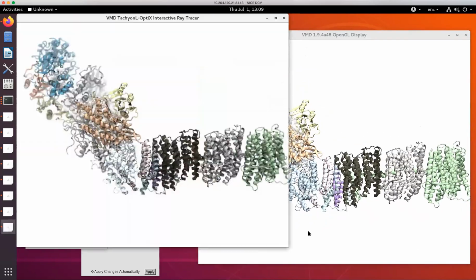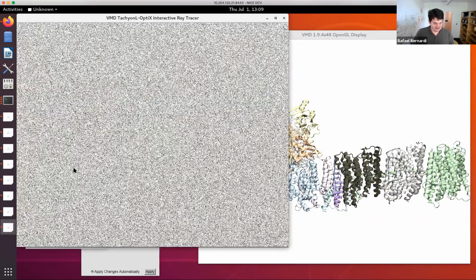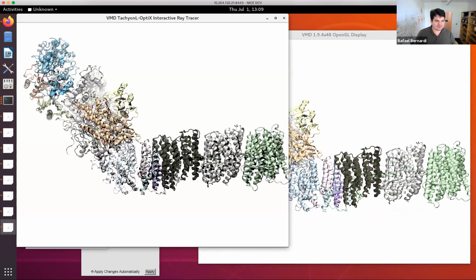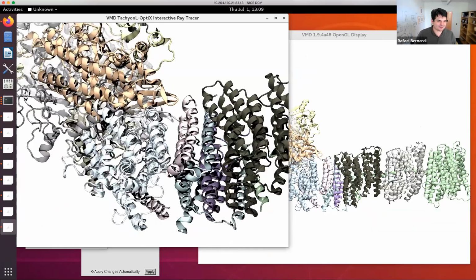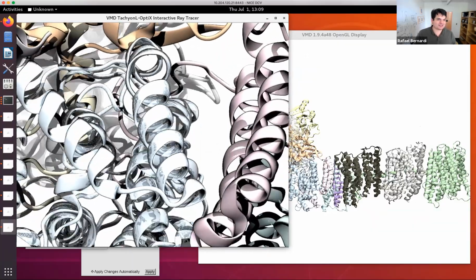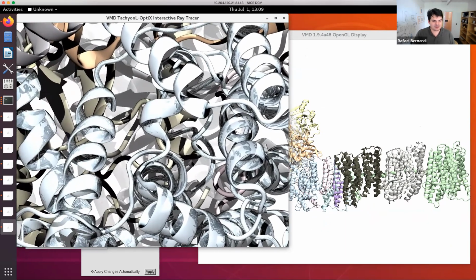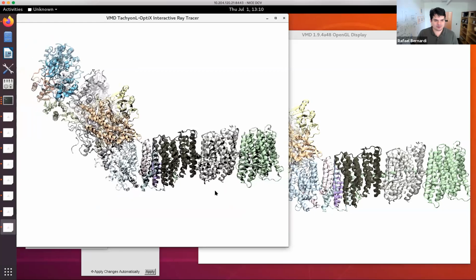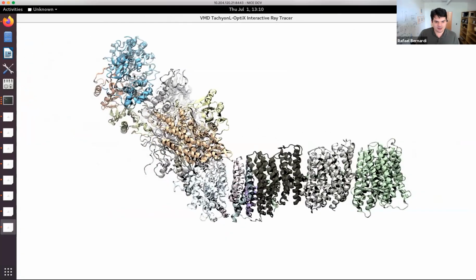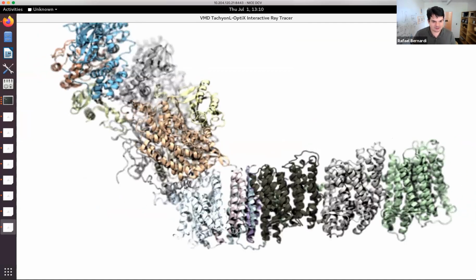Yeah. So the other thing that I like is, when I zoom in there, you start to have that cut clip problem, not really a problem, but when you're rendering you can go very close, because now it becomes like this object in this rendering mode, and you can move around the way you want. You can get very close to it, like I'm doing here right now. And back to this is the point where we start the rendering here. I can play with the focal point, like I was showing before. I can play up and down again.